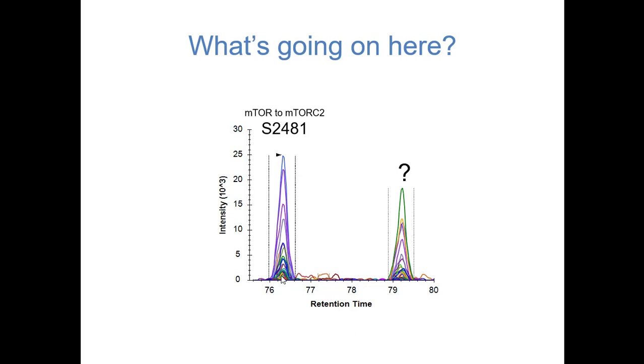The caveat I was thinking, when you're running a longer batch and your calibration is going up, would that affect your percent CV, for example? The reproducibility in your, like the resolution is going up.